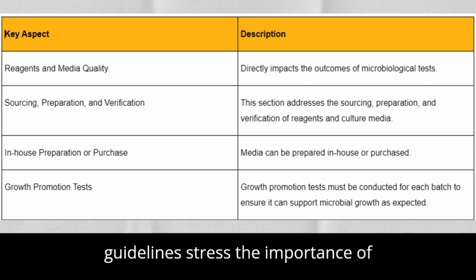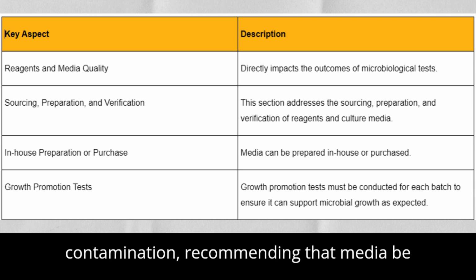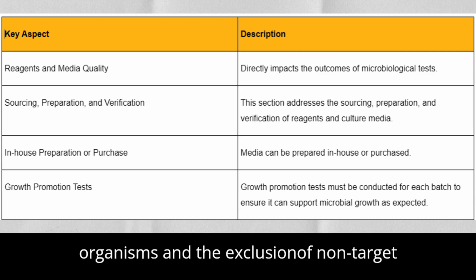The guidelines stress the importance of handling media carefully to avoid contamination, recommending that media be stored appropriately and validated for performance, including recovery of target organisms and the exclusion of non-target organisms.